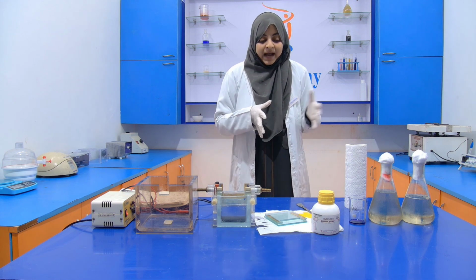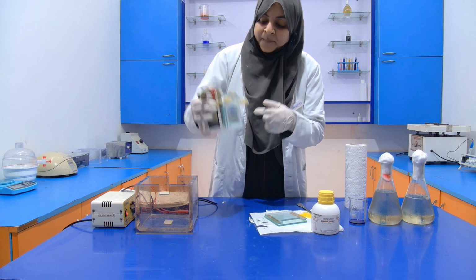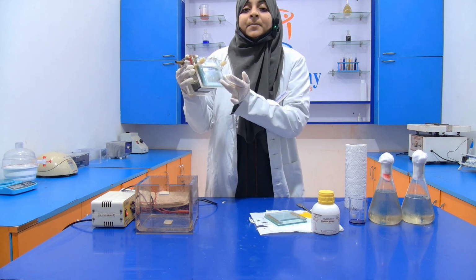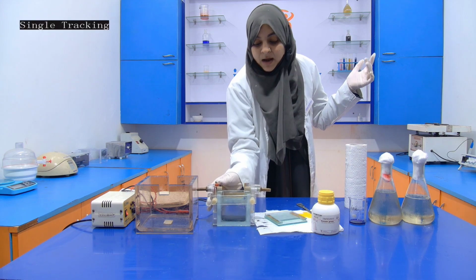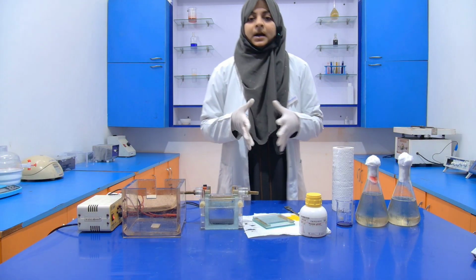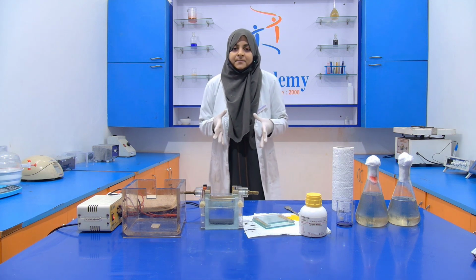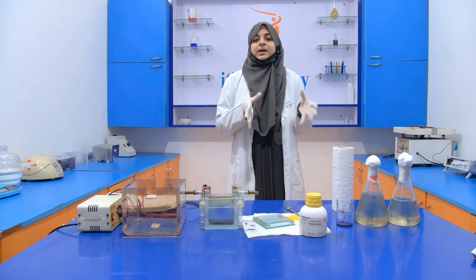After that, we have to pour the gel in between these plates. I already told you how we prepare these two gels. We add all the chemicals into the gel.